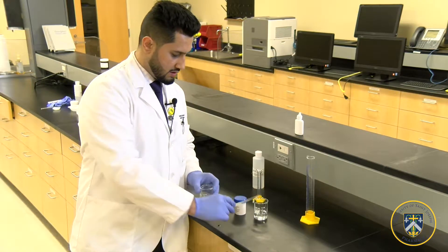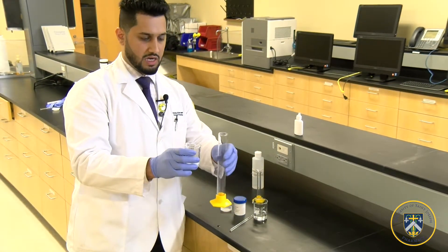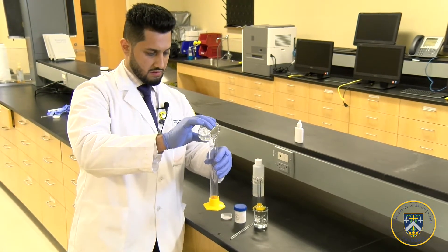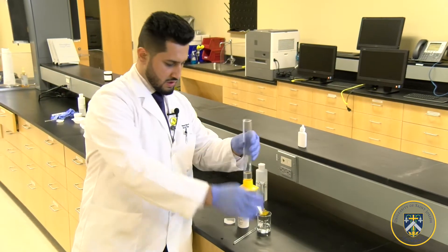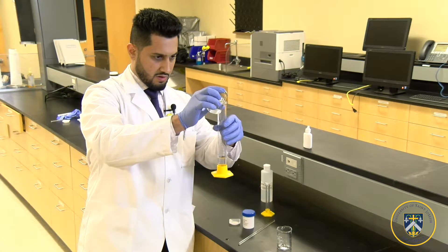And finally, I'm going to pour it in my graduated cylinder just to make sure I have the exact amounts. Then just add up to 30 mLs.